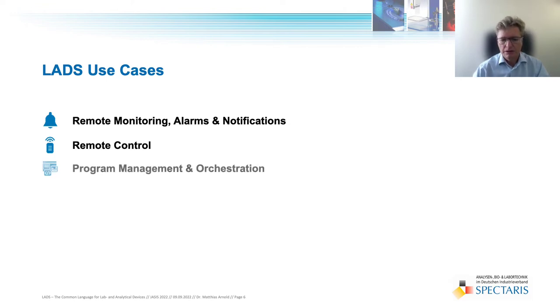Second, program management and orchestration. For example, listing all the programs on the instrument, selecting a program to be executed, starting the program run, monitoring the program's progress, and so on. For most devices, especially analyzers, result data is generated. This data usually resides on the instrument before being uploaded to an application like a data system. The program management and result management use cases form the basis for orchestrating instruments along workflows.